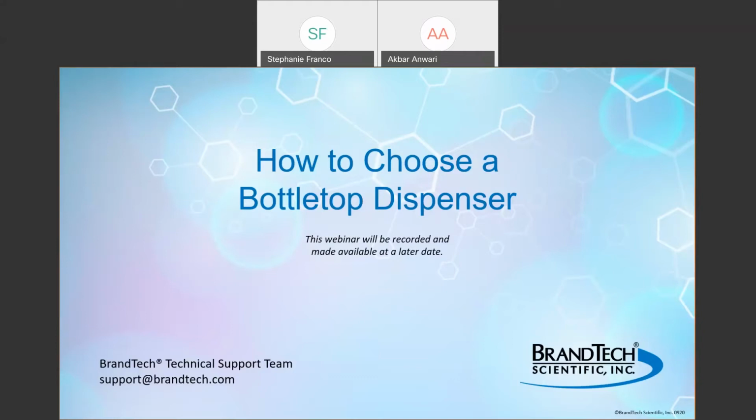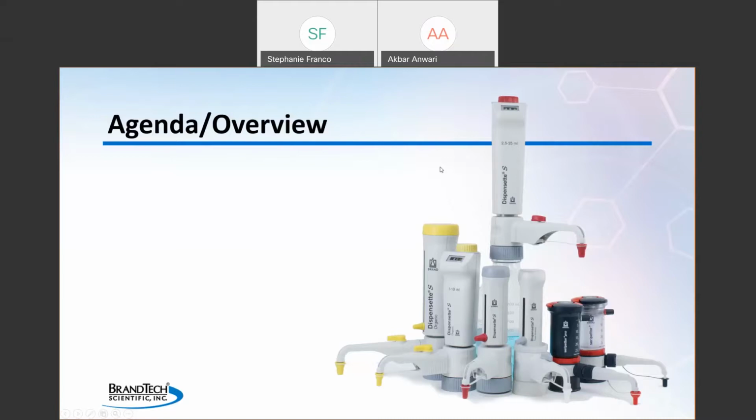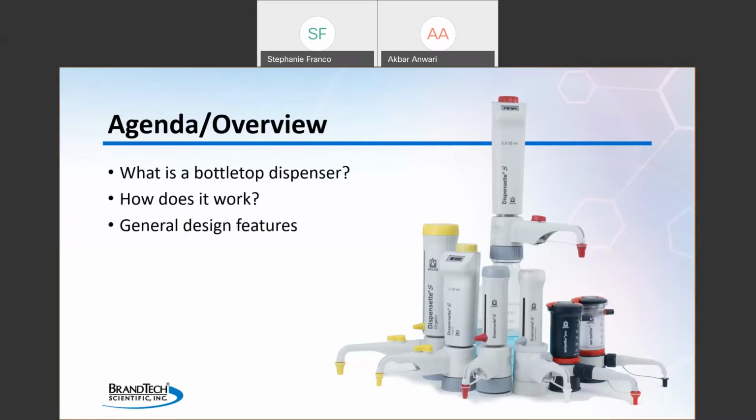Today's webinar, we will be discussing how to choose a Bottletop dispenser. Welcome to our presentation. As a general overview of the topics we will be covering today, we will discuss what is a Bottletop dispenser, how it works, general design features that make one design suitable for certain liquids and not others, safety and convenience features that may be important for different applications, and some economical designs that may be suitable for less demanding applications.